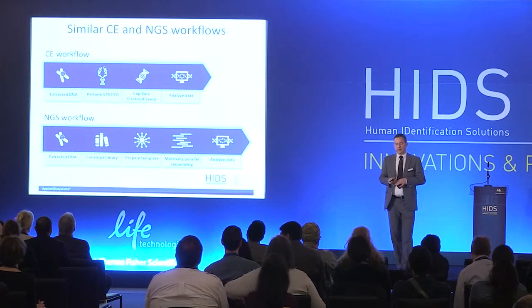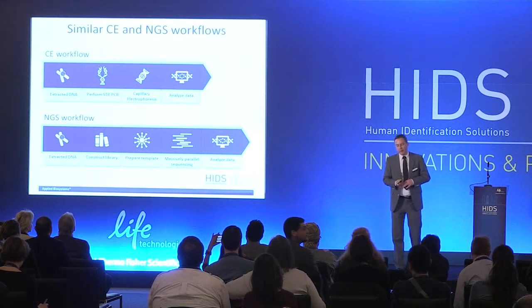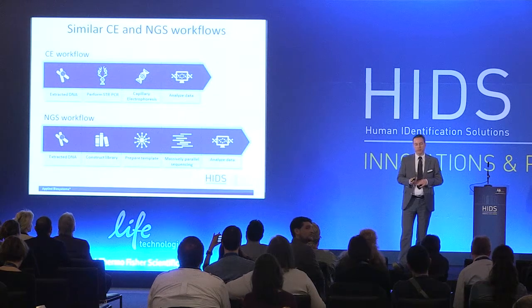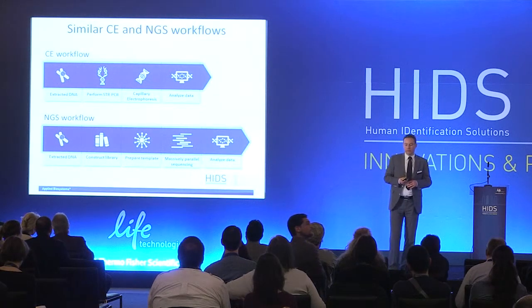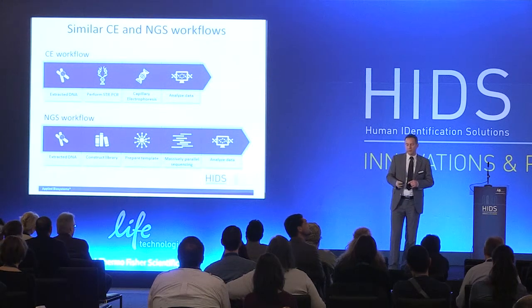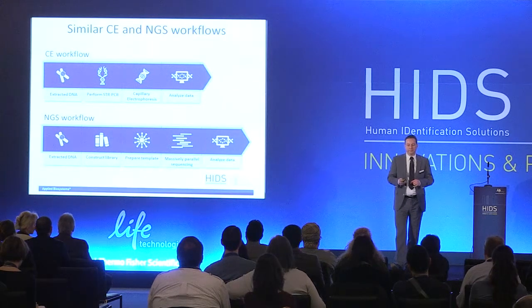Then this sequencing library needs to be connected to a template. In the case of the PGM system, these are tiny little beads to allow the sequencing machine to do the sequencing. And then you do the massively parallel sequencing on the PGM system and you analyze the data.